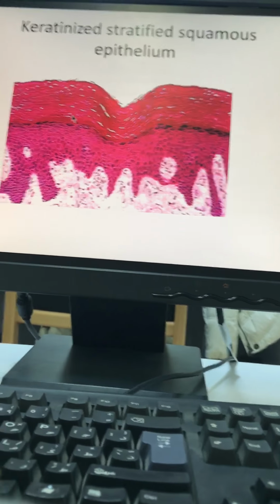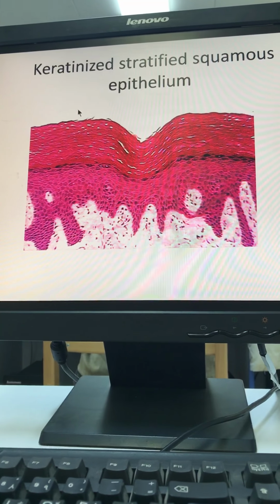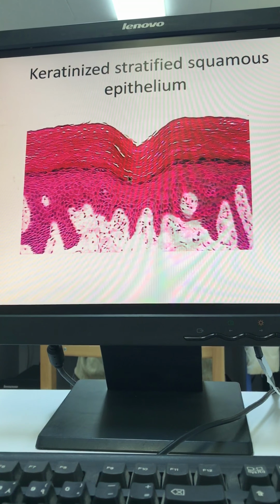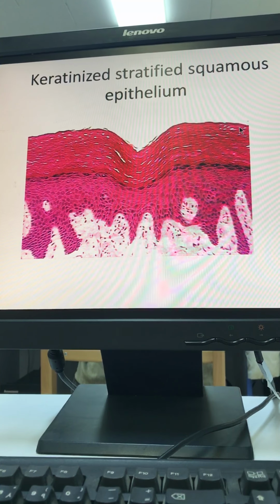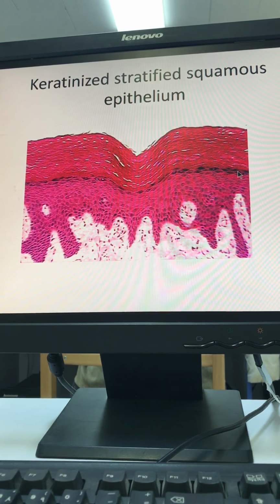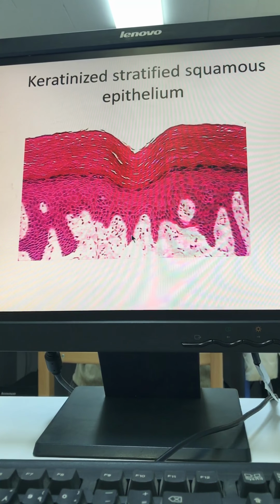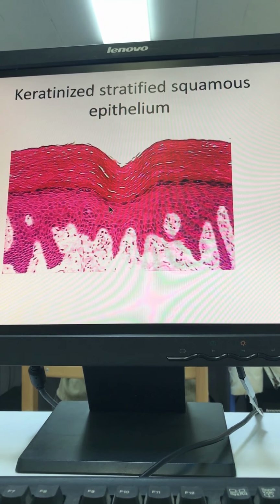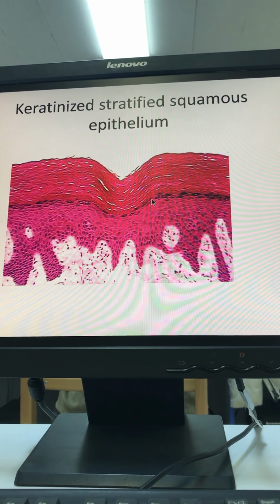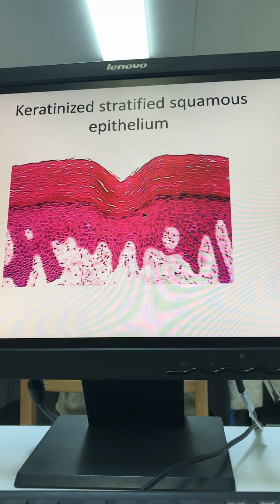Now here, this is my epithelium. Here the surface of my tissue. On this is a space, okay, the space. Now you can notice here we have no nuclei. I have no nuclei here. Here we have flattened nuclei. Now those are the basal cells. We have more than one layer. This is stratified type of epithelium. The top surface cells have flattened nuclei. Then it's stratified squamous epithelium, stratified squamous.